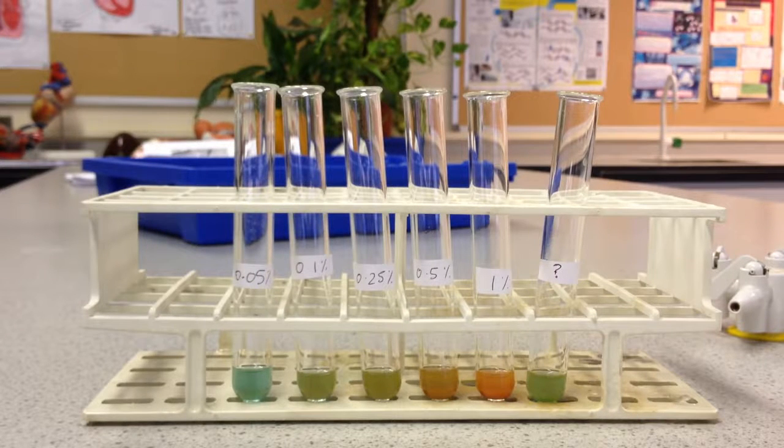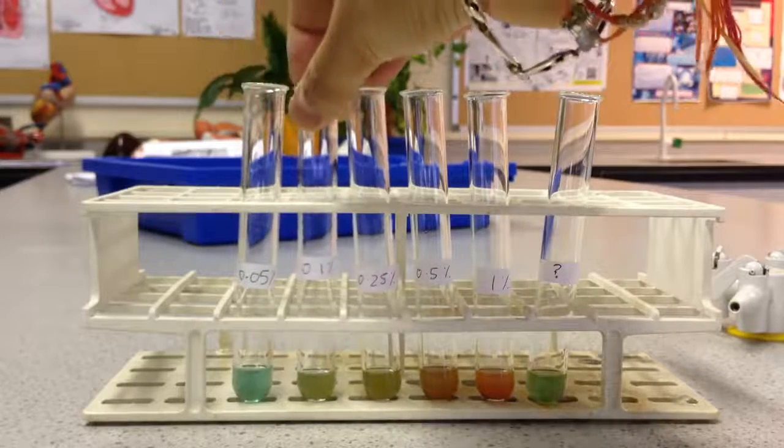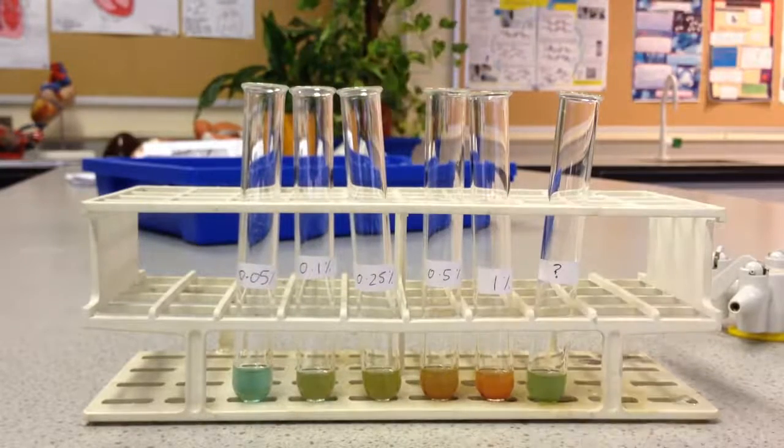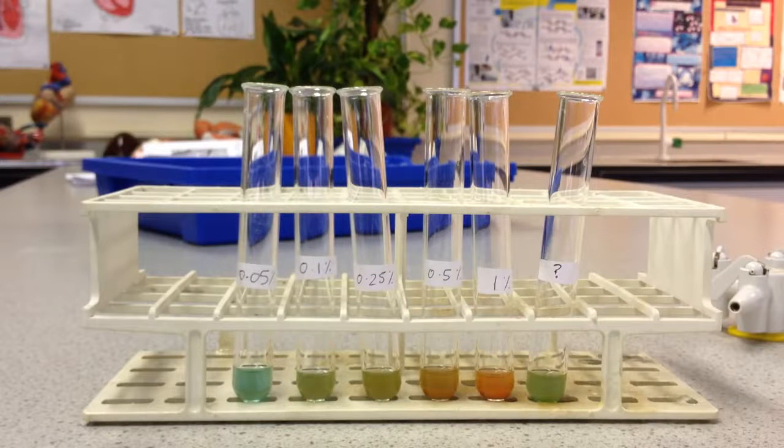So a more accurate way of doing this would then be to make what's called a calibration curve of the absorbances of these solutions. So actually measuring quantitatively the amount of reaction that's occurred in all these tubes. And I'll show you next how to do that.